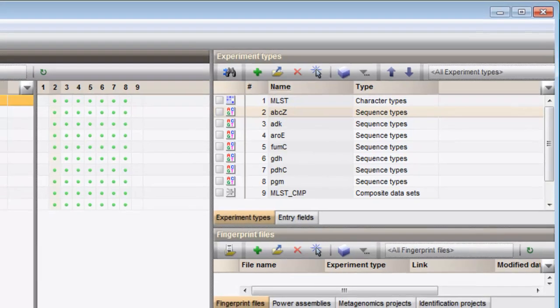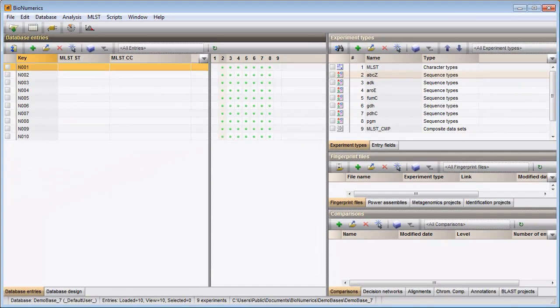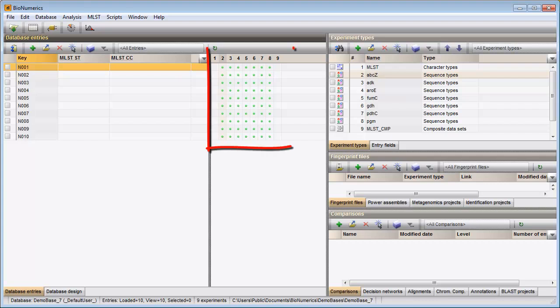For each experiment defined in the database there is a column present in the Experiment presence panel. Since 9 experiments have been defined in this database, 9 columns are present here.